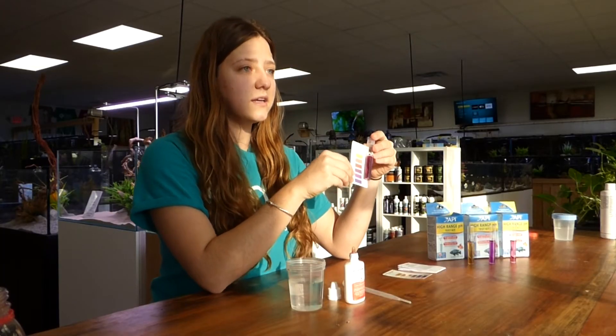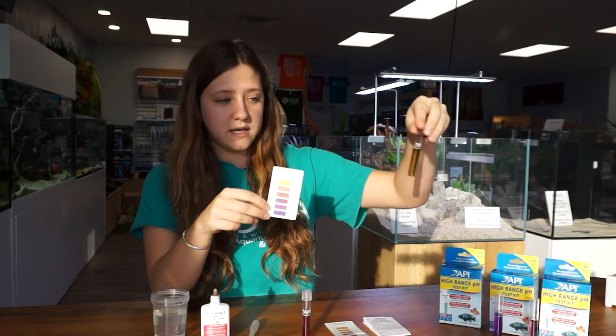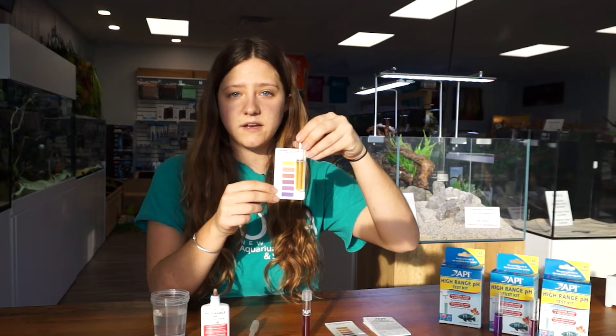This test looks like it conducted a pH of around 8.2. I also have a few other examples. This is an example of the low range of the test kit, reading at 7.4.